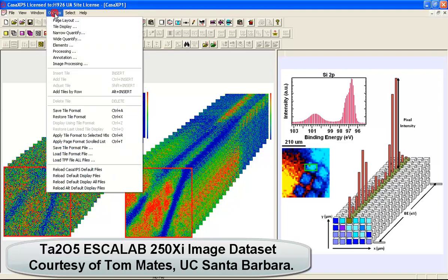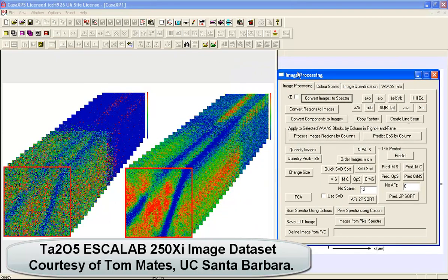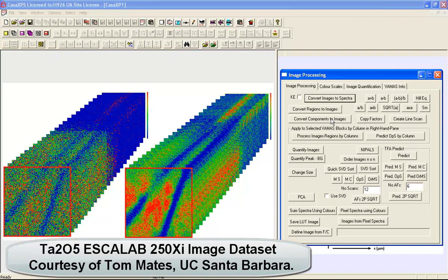In this video we're going to look at options on the image processing dialog window that relate to principal component analysis. The idea of principal component analysis is that we can transform a data set for which noise is a significant component and remove that noise, so we end up with a data set where the signal is the most significant component and we see spectra that have shapes consistent with what we would expect from a spectroscopic measurement.